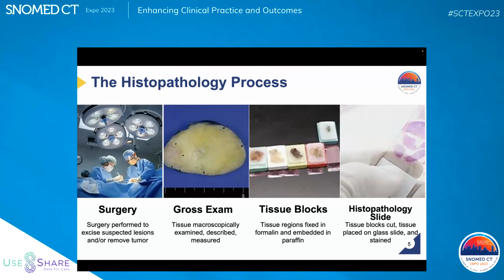So let's say it's the colon. It could be the colon. It could be tissue around the colon. It could be parts of organs juxtaposed to the colon. It certainly will be lymph nodes and other things like that. So the surgeon takes these pieces of tissue out, and based on how the surgeon extracts them, they're called parts, and those parts get sent to the gross room. Yes, and you get this thing, and it's gross because it's big and disgusting, but mostly because it's big.